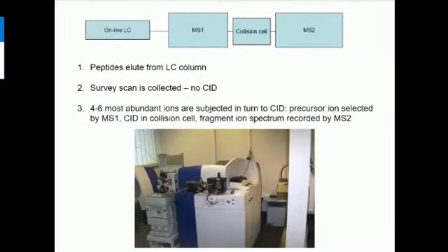Okay, so this shows an overview of the workflow. Those of you that are doing 9 will be coming for tutorial in the lab later, and we'll have a look at the instrument that we do this on. This example here is a QTOF. Okay, so you've got your protein, you've digested it, so you've got a mixture of peptides. They're separated by liquid chromatography, and then as they elute from the LC column, they enter the mass spectrometer.